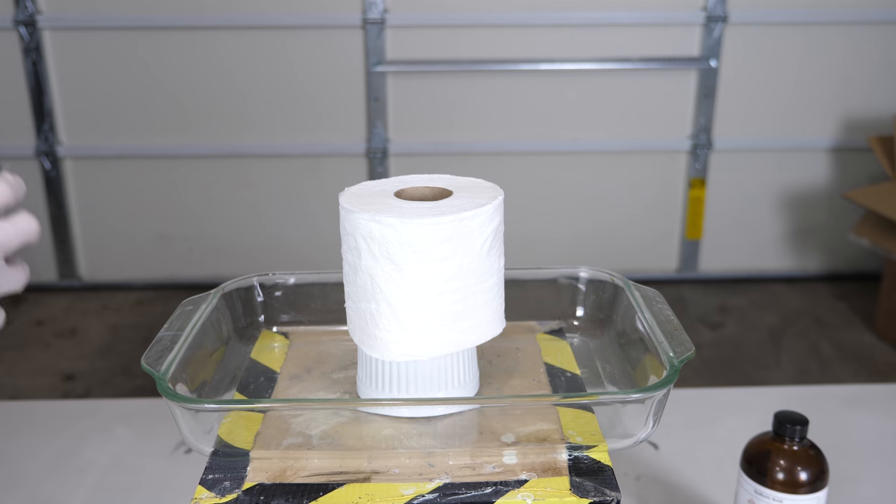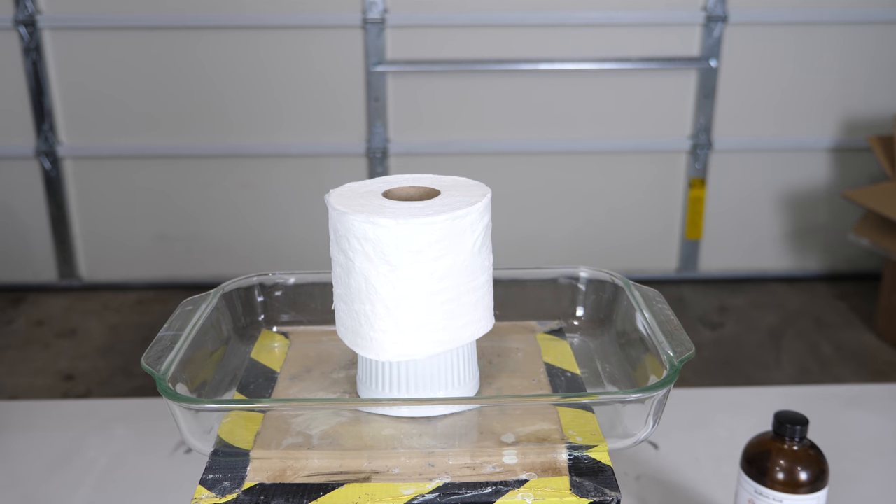So first we'll start with a smaller roll and then move to a bigger one. Okay, here we go.